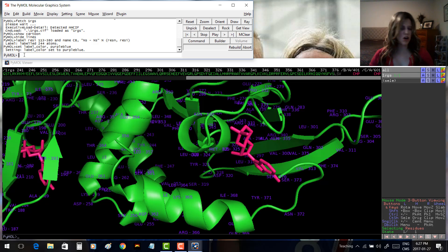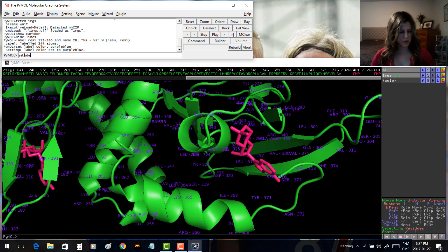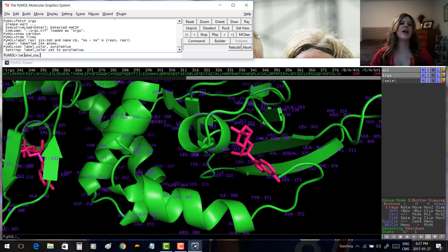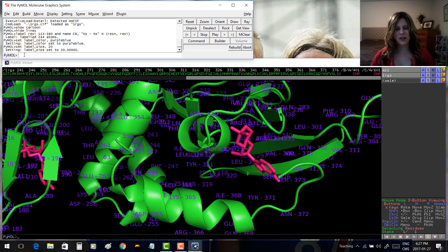The labels are kind of small, so let's make them bigger. Type 'set label_size, 20' and press Enter. That makes them nice and big and a little easier to see.